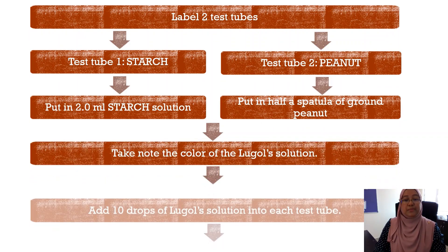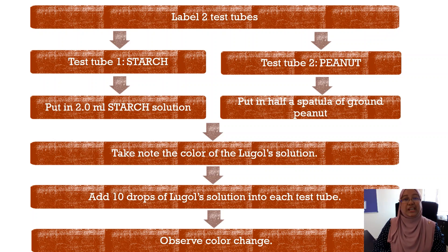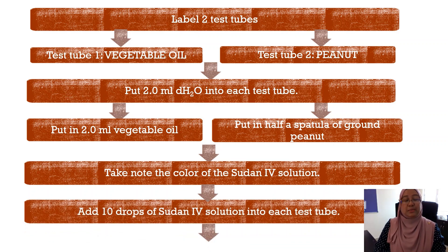This procedure is carried out to determine the presence of polysaccharide. Label two test tubes: test tube one for starch, test tube two for peanut. In test tube one, put in 2 ml of starch solution; in test tube two, put in half a spatula of ground peanut. Take note of the color of the Lugol's solution, then add 10 drops of Lugol's solution into each test tube and observe any color changes.